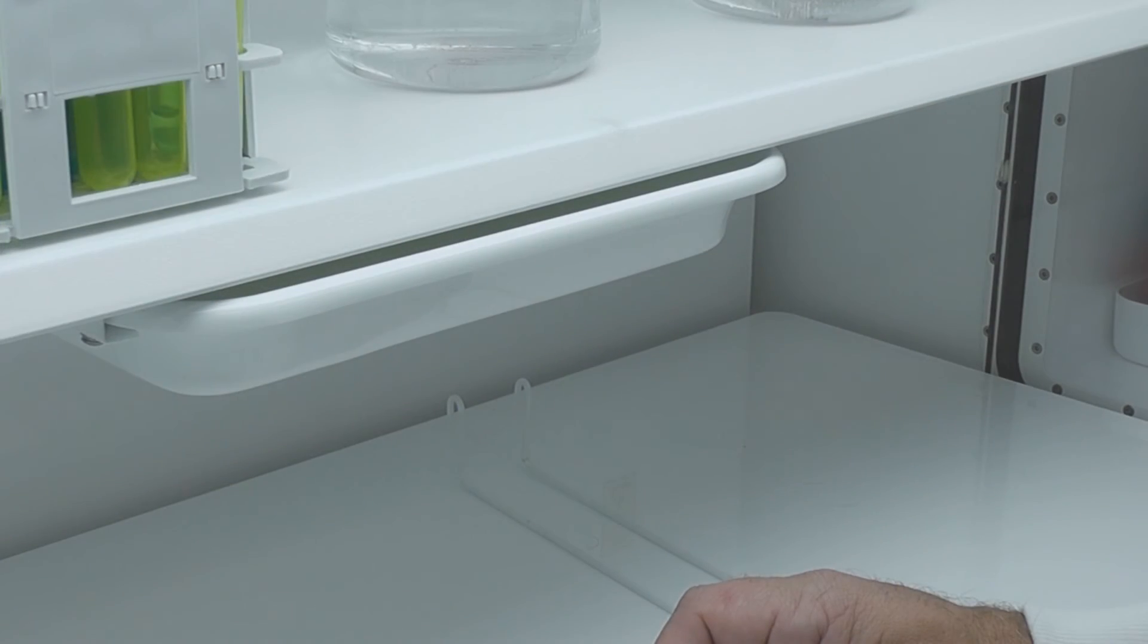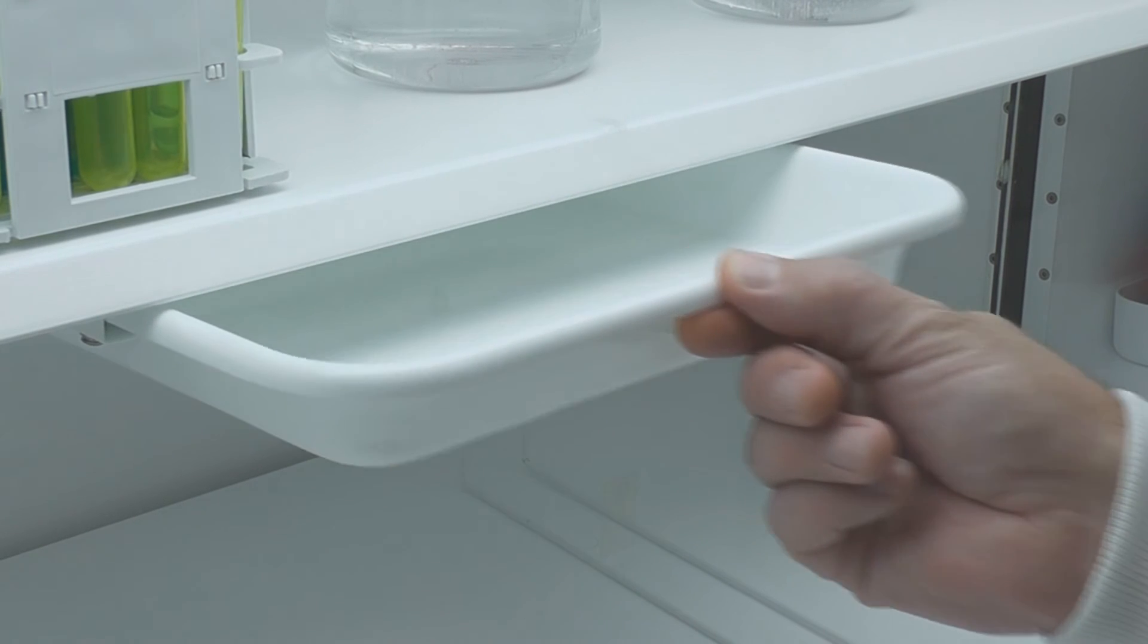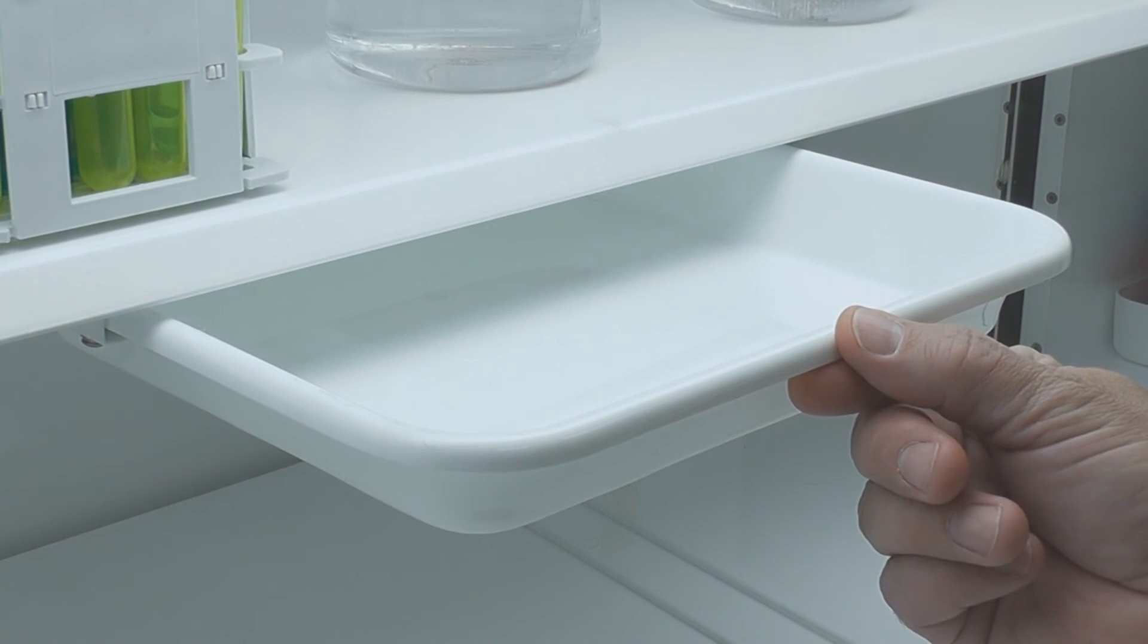One or two storage trays can be positioned under the shelf. This is either a factory fitted option or trays can be fitted on site.